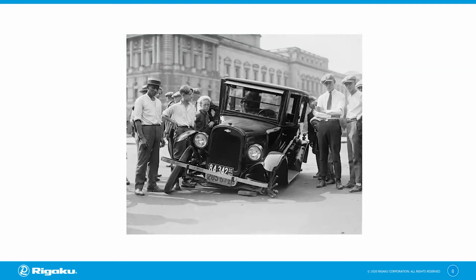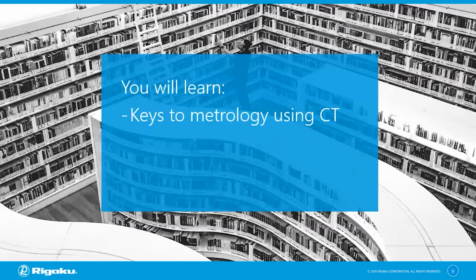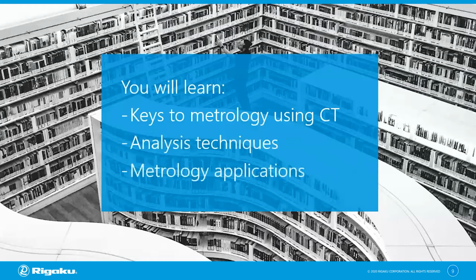So today, we're going to discuss how we can use X-ray CT for metrology. In this webinar, you will learn some keys to metrology using X-ray CT and analysis techniques, and we'll take a look at a number of metrology application examples.